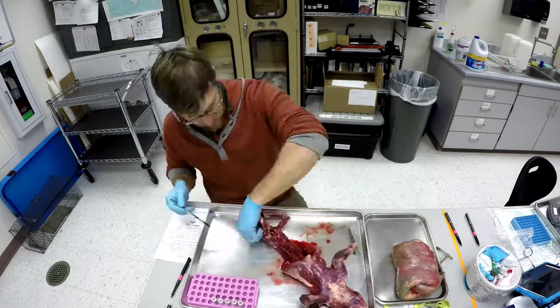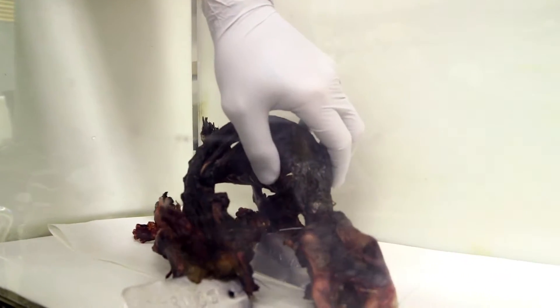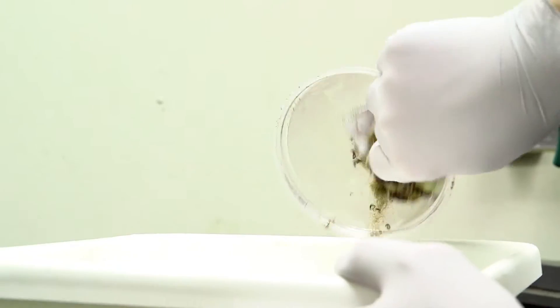Tissue samples are taken and frozen, then we remove any remaining flesh from the skeleton. Once the skeleton is dry it is given to our beetle colony. The beetles will eat all the dry tissue off the bones, even the inside of the skull, leaving a nicely clean skeleton. For a marmot like this the process will take about two to three weeks.